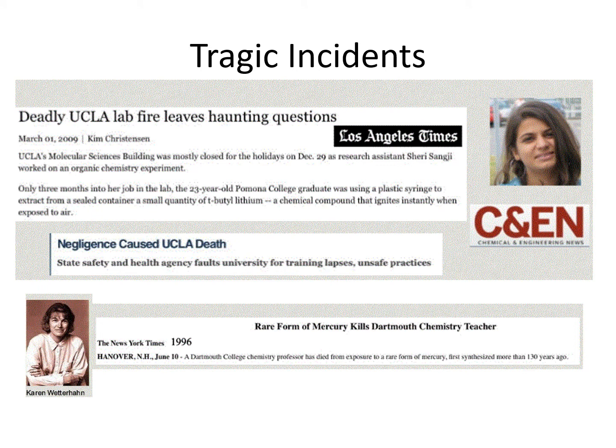Unfortunately, there have been tragic incidents in labs across the United States, both undergraduate and graduate, including deaths. Here at UTEP, there haven't been any deaths, luckily, but there have been some grad students that lost an eye. There have been several glass cuts and some chemical burns, but nothing that required hospitalization or anything other than the grad student who lost his eye. So we're working with some pretty bad stuff. Luckily for y'all, nothing at all this semester, but you always have to be aware of stuff and be very careful while you're working with it.